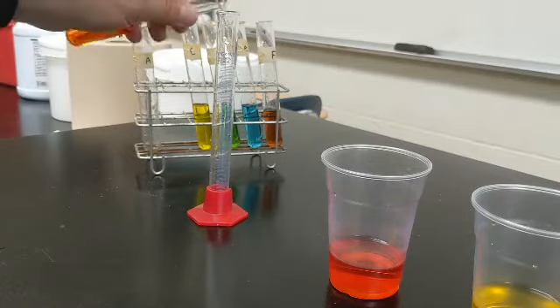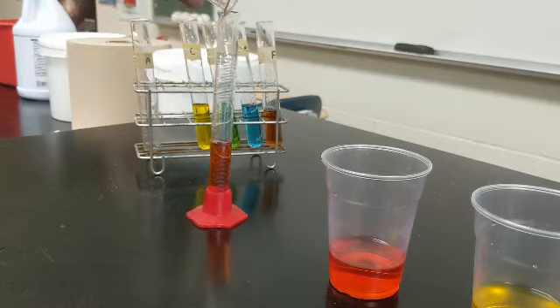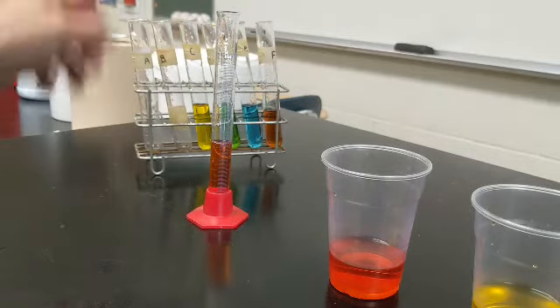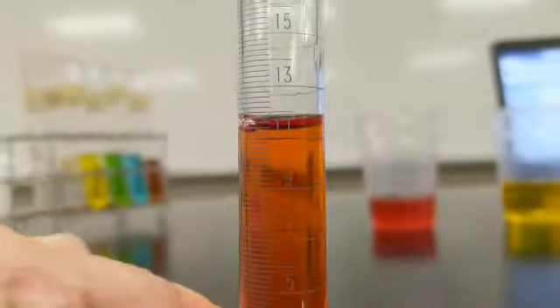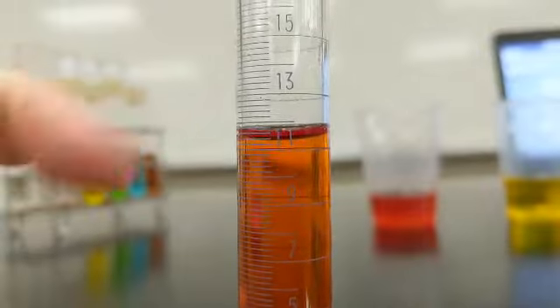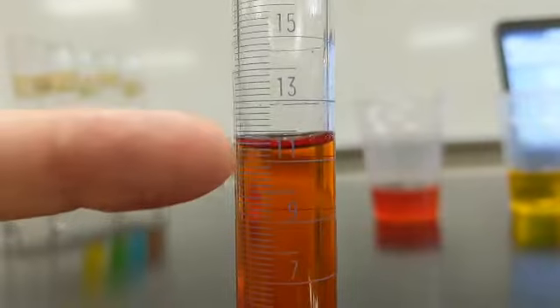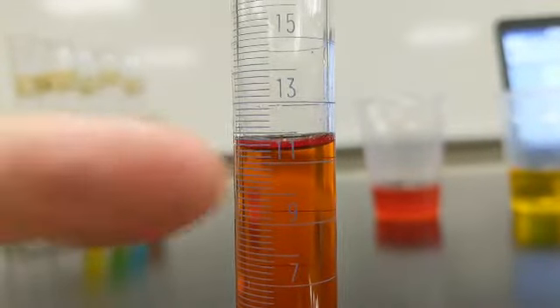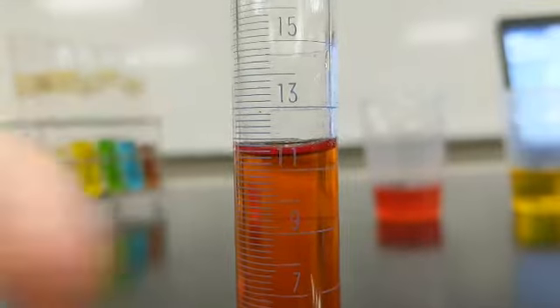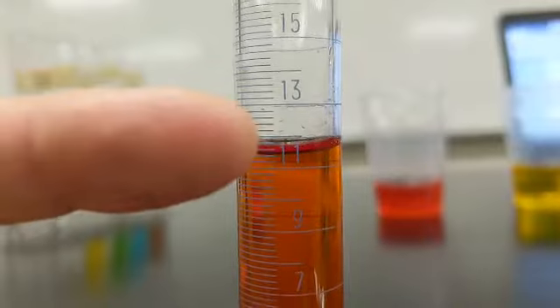Okay, test tube B. Okay, so the big line under the 11 represents 11 milliliters, and it's in between 11 and 12. Now 12 isn't labeled with a number, but we know what's in between 11 and 13, and that's 12.